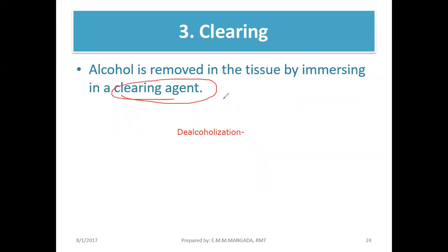So guys, the most commonly used clearing agent is actually your xylene. Okay, your xylene. So that's for the clearing. Guys, ma'am, bakit the purpose of this process is to remove the alcohol? So we call it dealcoholization. Bakit clearing? Bakit siya tinawag na clearing? Mas akma naman yung term na dealcoholization.